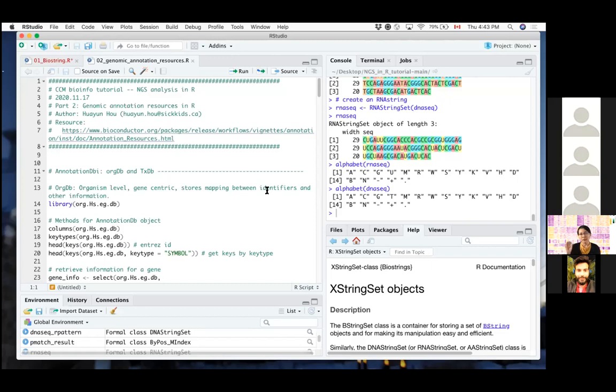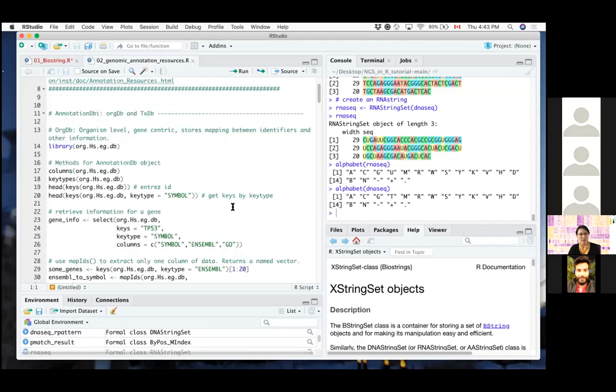And you can get them through many different ways. You could certainly just download each individual resource and then compile a database yourself. But this process has been made easier through R, as there are a lot of these annotation databases that are already pre-compiled for you and are pretty easily accessible. So I'm going to walk you through some of the most commonly used annotation packages in R.